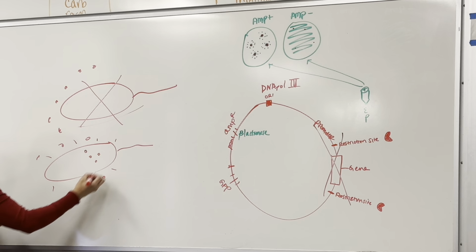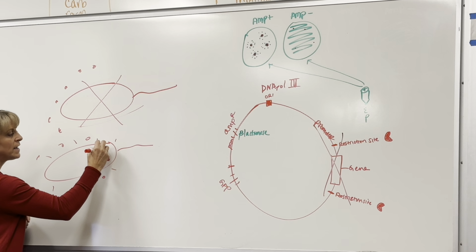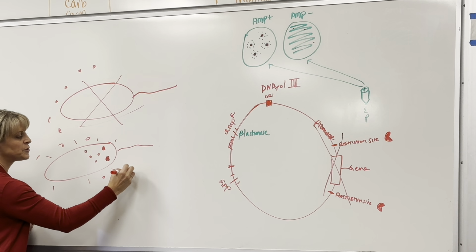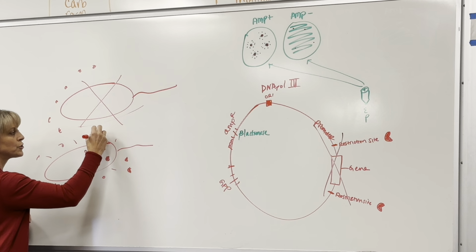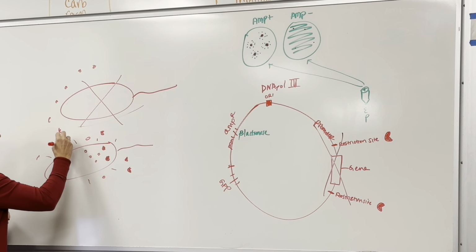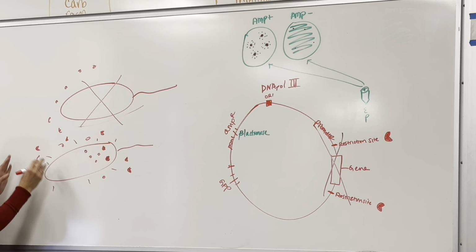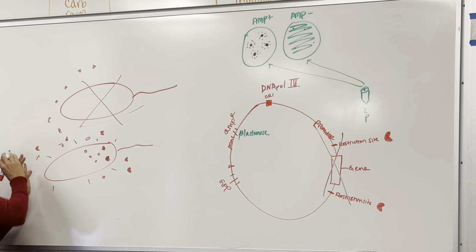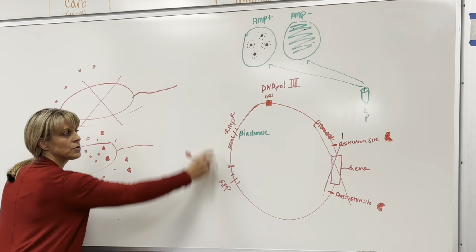So what these bacteria are going to do is make this beta-lactamase enzyme and spit it out all over the place. This enzyme is everywhere because they're trying to protect themselves. Because they glow in the dark and they're spitting out beta-lactamase, because they took up our plasmid and we told it to do those two things.